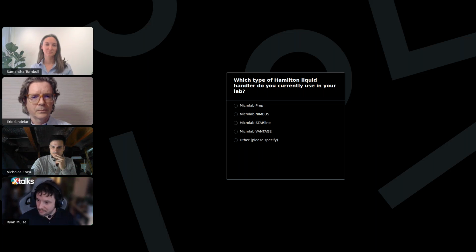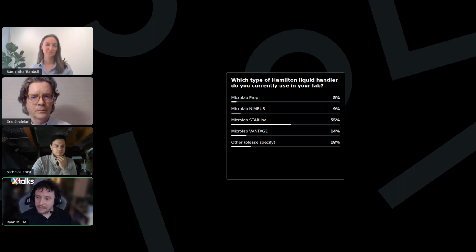All right, it looks like we have most of our answers in. Thank you everyone for participating in this. Let's go ahead and look at the results. We have 55% of you selecting Microlab Starline, then 18% for other, 14% for Microlab Vantage, 9% for Nimbus, and then 5% for Prep. So again, thank you so much for your participation.